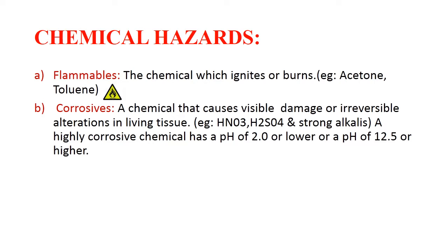Corrosive: a chemical that causes visible damage or irreversible alterations in living tissue if it comes in contact with the skin. Examples are nitric acid, sulfuric acid, and strong alkalis. A highly corrosive chemical has a pH of 2 or less, or a pH of 12.5 or more. This is the logo for corrosive substances.